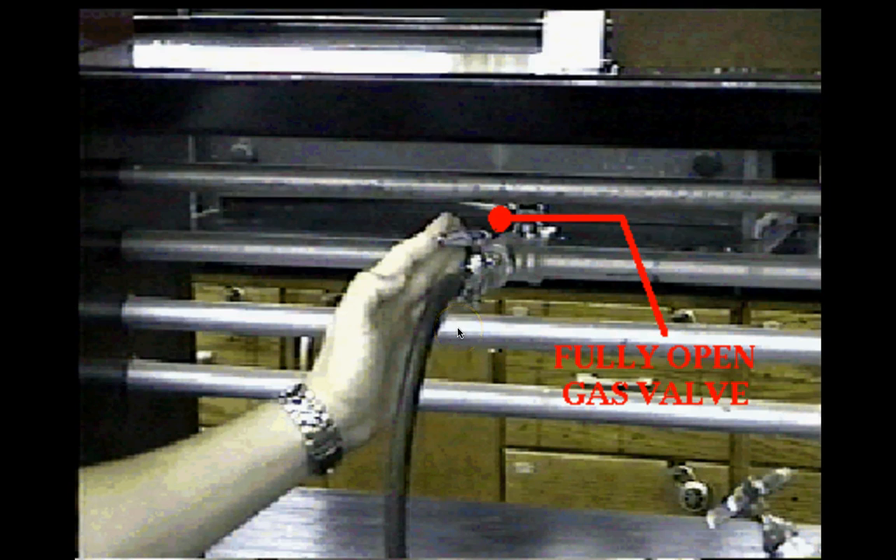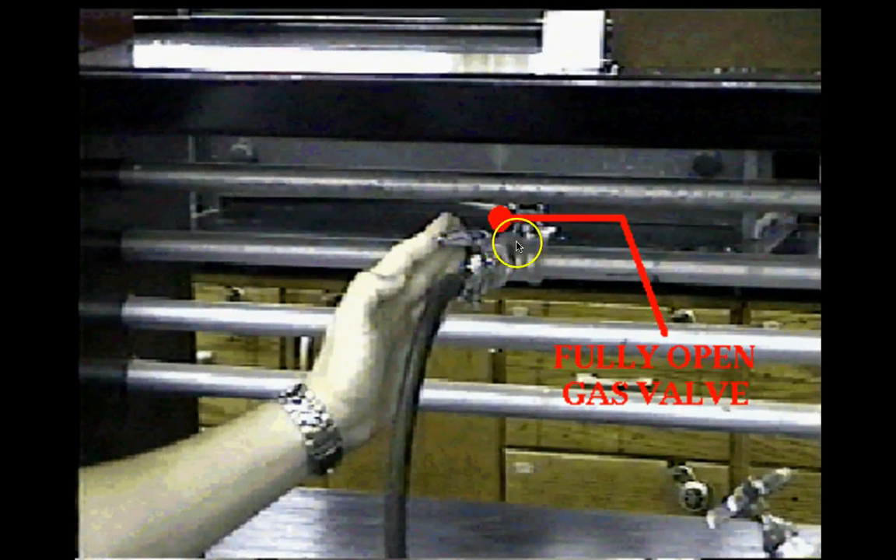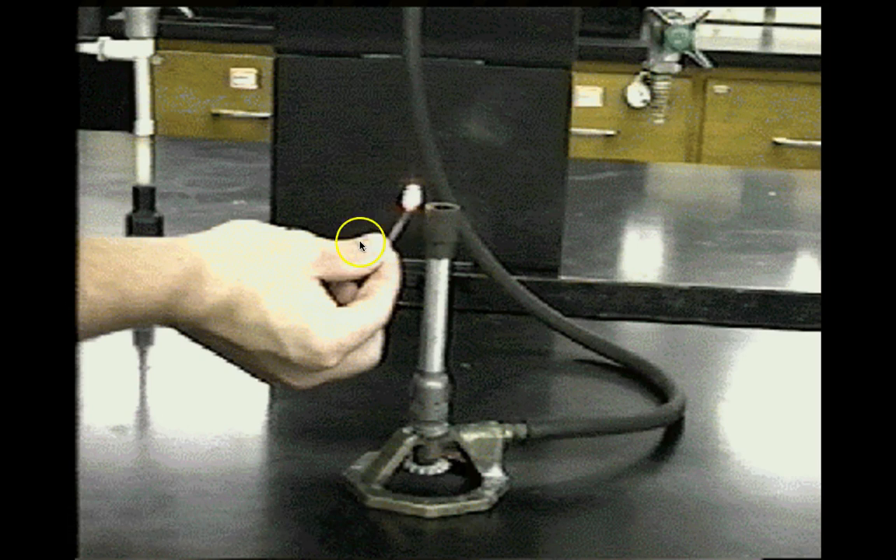When the valve handle points one way it's off, and if you keep turning it all the way to the other side it's off again — some people get confused by this and accidentally turn it back off. So: light the match first, hold it underneath the burner top (not above it), then go turn on the gas valve. You should get a flame. Never turn the gas on first and then try to light the match.